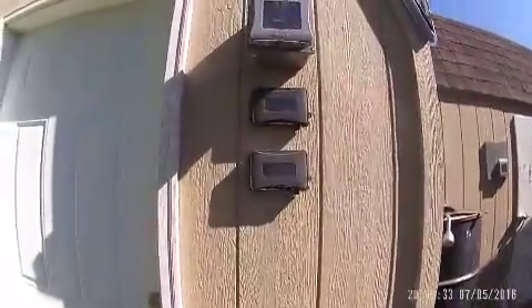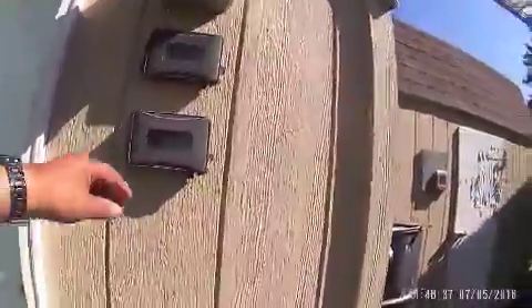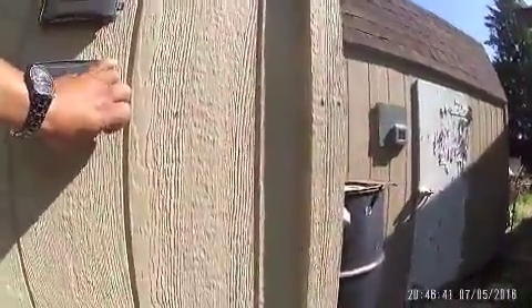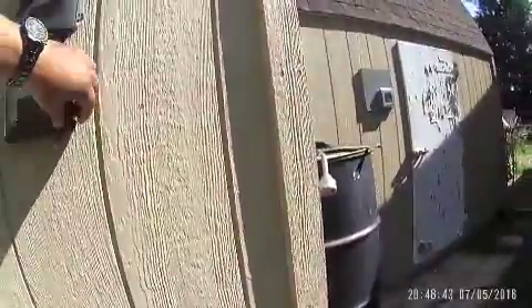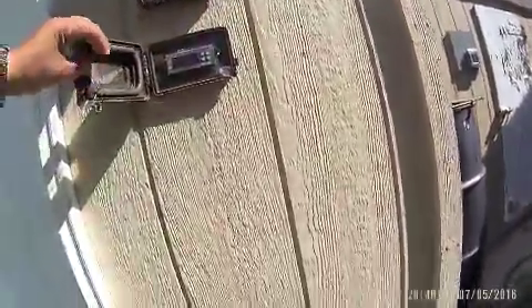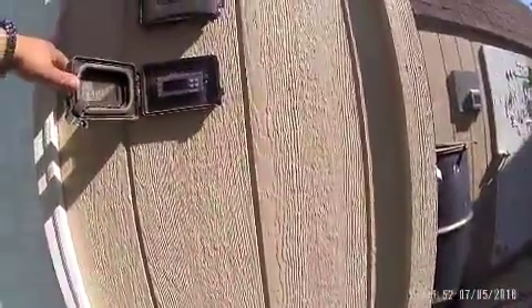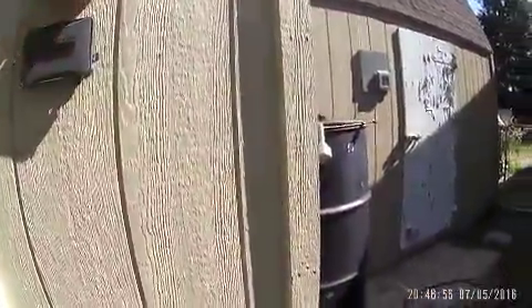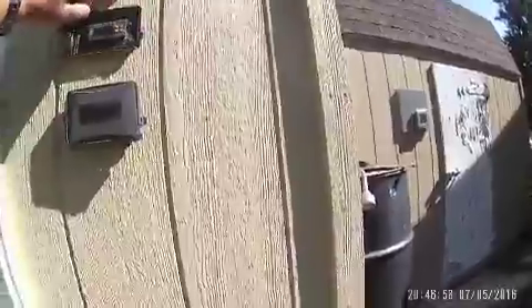I'm gonna go ahead and take a look at the laboratory. Right now all I'm using is the temperature — it's about 26 degrees Celsius, 26.4 I think. I'm not running the humidity stuff right now, but there's the humidity sensor.